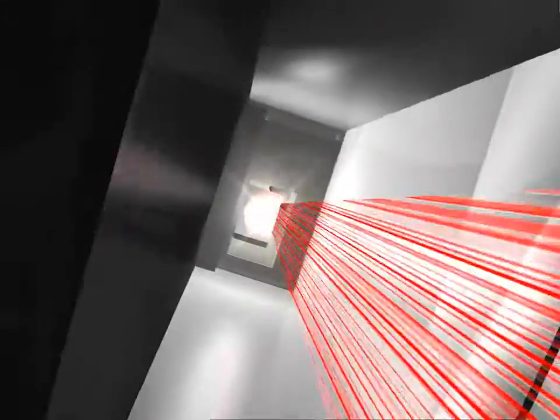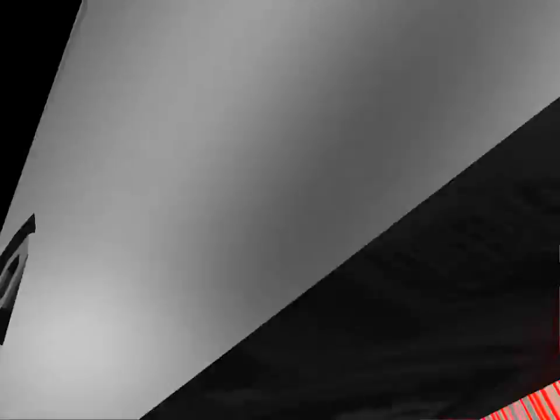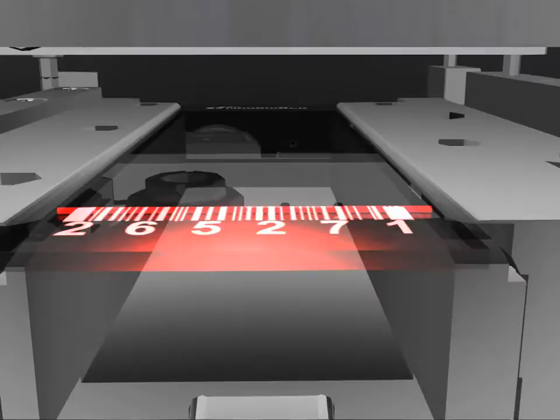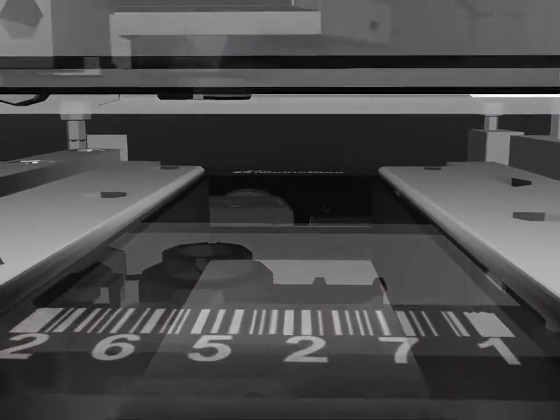The reliable barcode reader with 2D barcode support ensures that data from each experiment will not get mixed up.